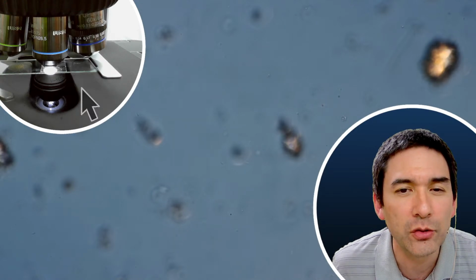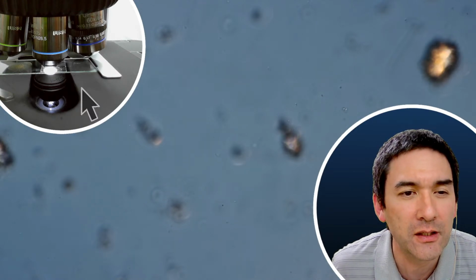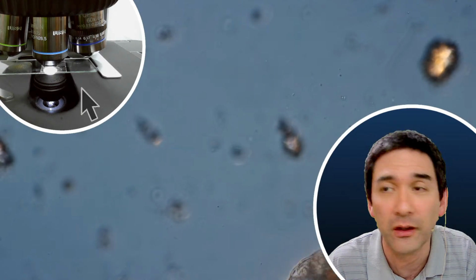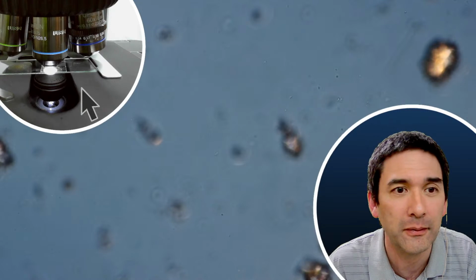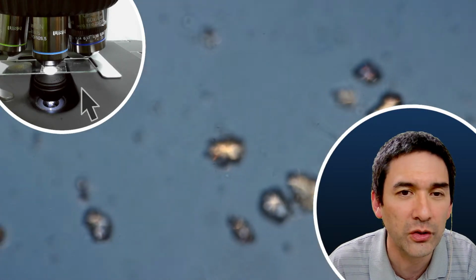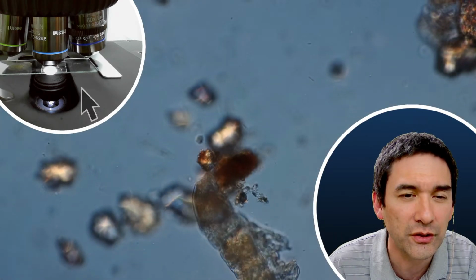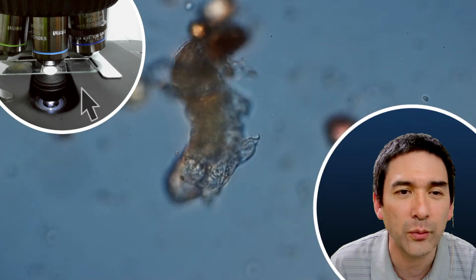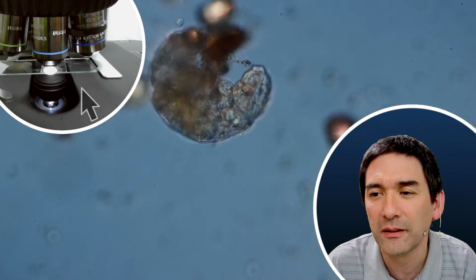Evidence is presented to show the existence of hermaphroditism in tardigrades. So apparently it's possible that they are both male and female at the same time. Oops, now it's gone again here. At least this is according to some research. Then again, with 1,300 species, yeah.